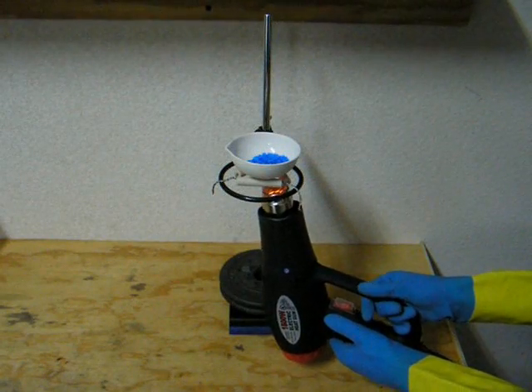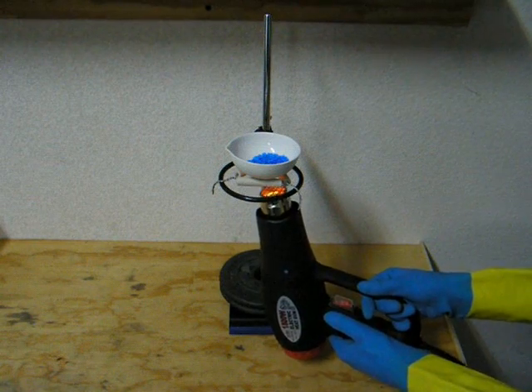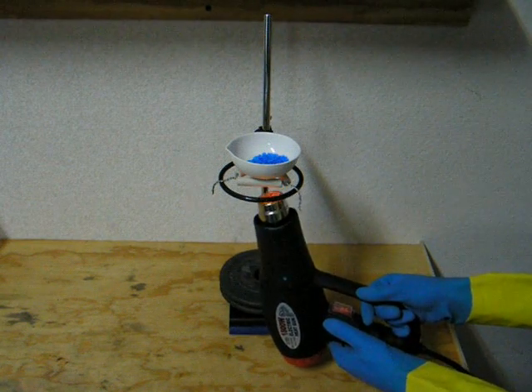Grab a heating gun and turn it on to high heat. Heat the bottom of the crucible evenly. A blowtorch or an alcohol lamp will also work if you don't have a heating gun.